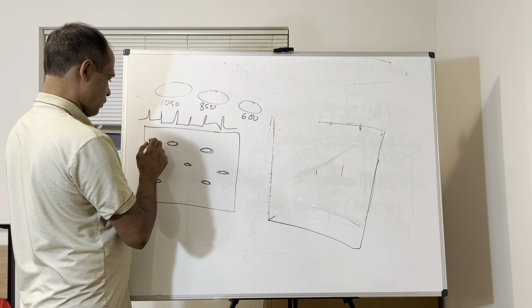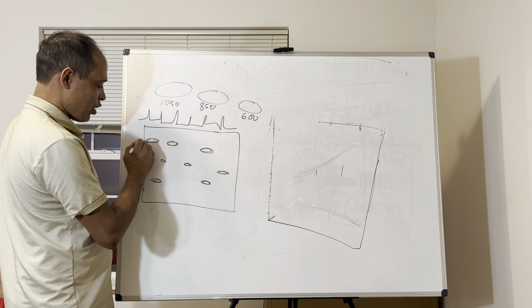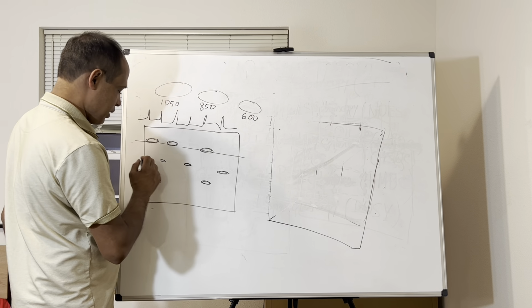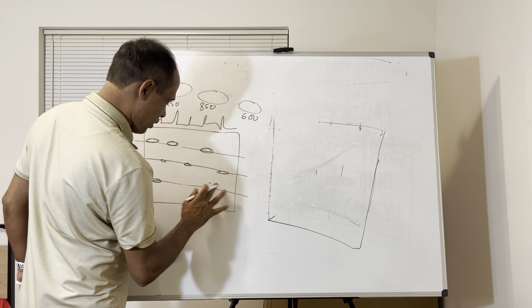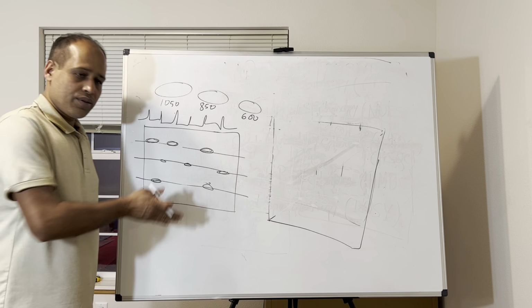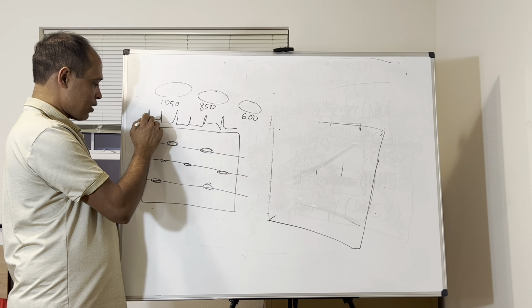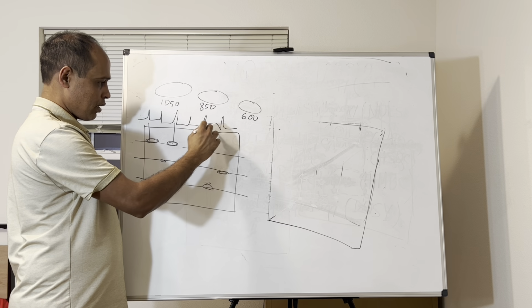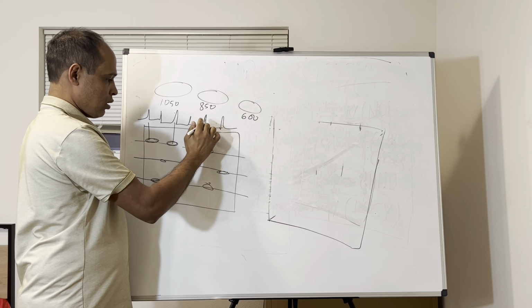Okay, but in the field you will see some of the protons like this. So if you can draw a line on those peaks, you can say there are 3 different lines you can draw here. So this peak is corresponding to this peak and this peak, and this peak.